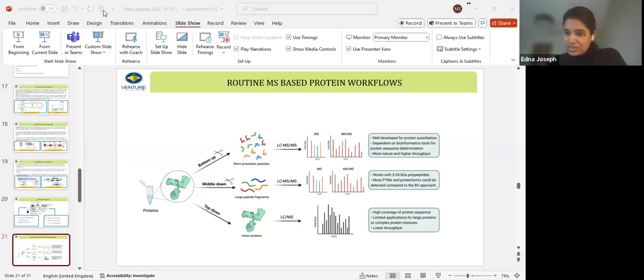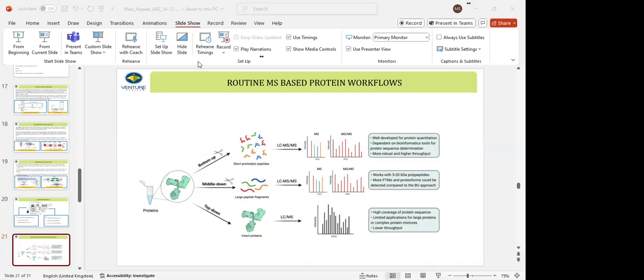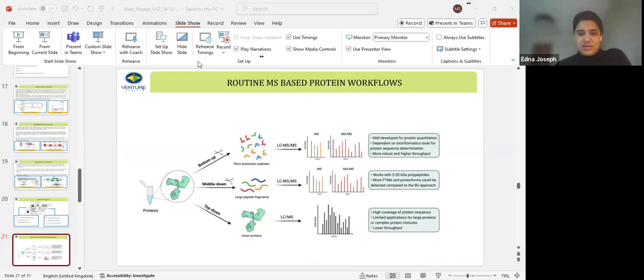There's another question from Aditya. What is the difference in the UV detector used in HPLC and UV? Ijaz, do you want to take this up? What is the difference in the UV detector used in HPLC and UV?